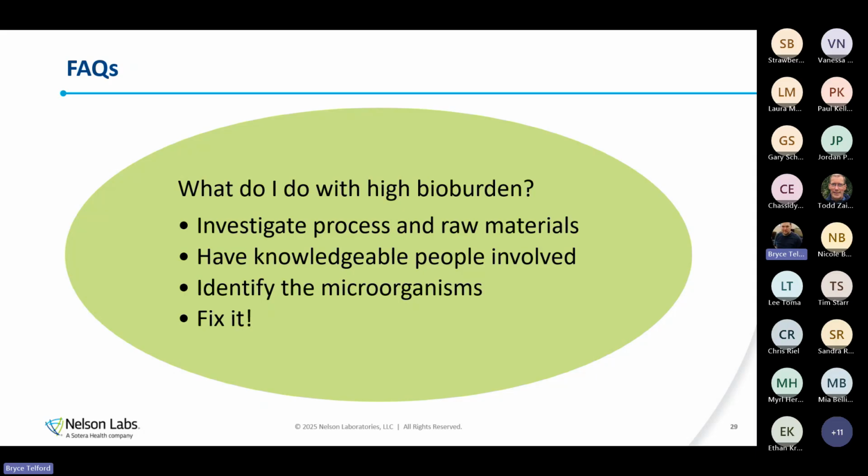So we started looking into it and we did what we refer to as investigational testing. So we took their device and we broke it out into components and we tested the individual components to see which components potentially have this gram negative organism and which ones don't, so that we can try and narrow it down. Well, what we found is all of the components had this gram negative organism. And we sent it again for identification, and it came back as the same organism. It was a gram negative organism.